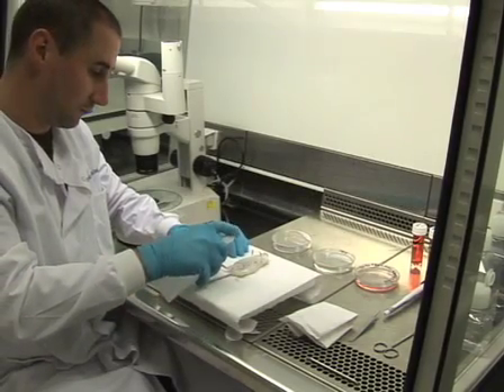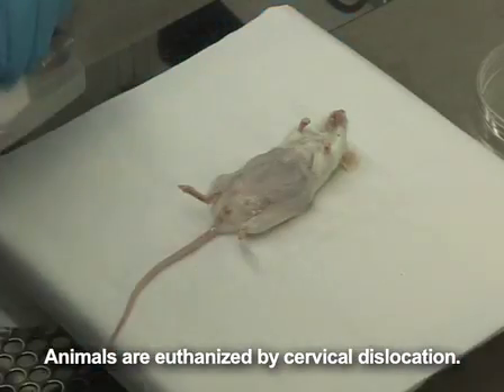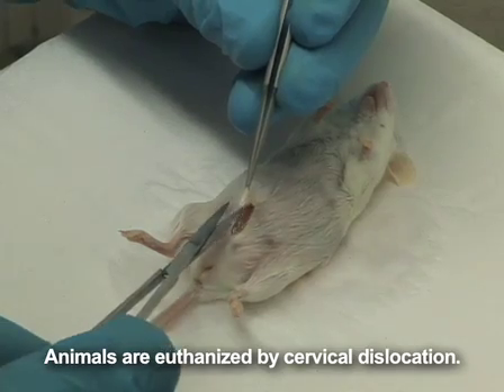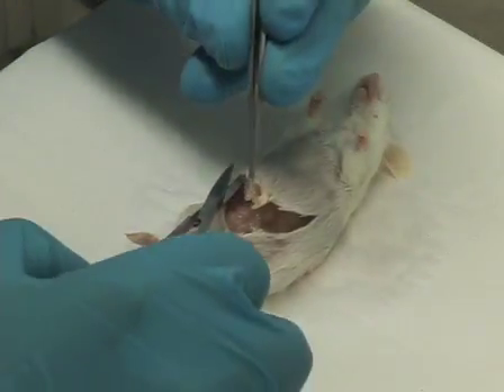The first step to preparing thymus organ cultures is to harvest day 14 or 15 mouse embryos from 1 to 2 pregnant dams. First, spray the euthanised mouse with 70% ethanol, then use forceps to pull upon the fur and make a V-shaped incision in the abdominal region with scissors, starting from the bladder and continuing up the two lateral horns of the uterus.